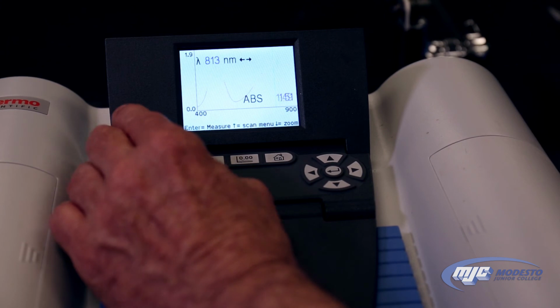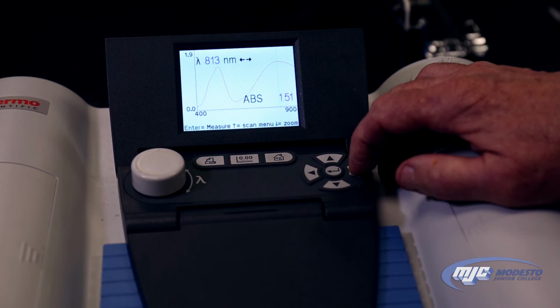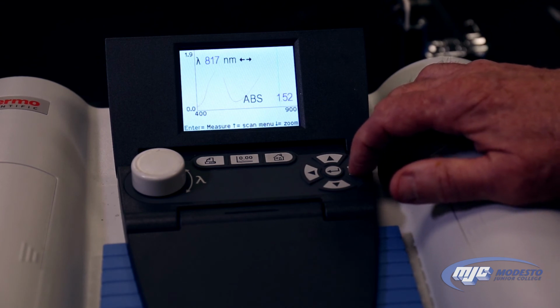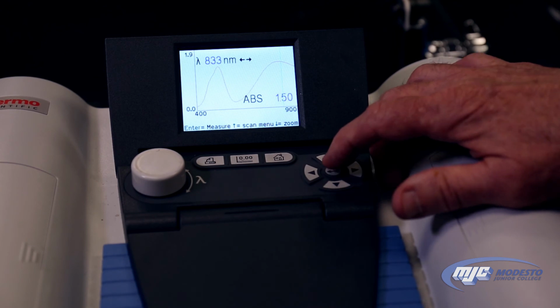So somewhere around there. I see 1.51, so I'm going to arrow over, see if I can get that any bigger. There's 1.52, 1.52 again, and it's going down.